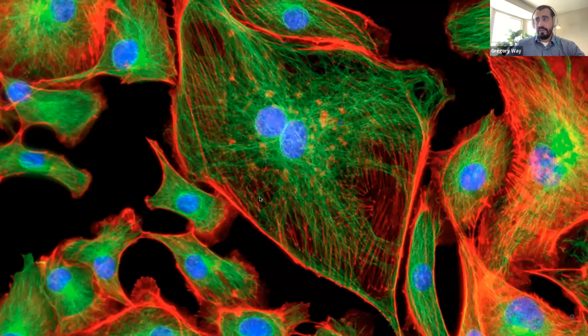So this is kind of just an example of the types of images that my lab studies. This is a cell painting image of various dyes that are targeting unbiased organelles within a cell. So I'll talk in much more detail about this assay, but just to get a sense of the kind of data that we work with.